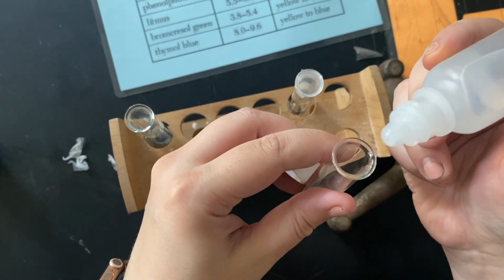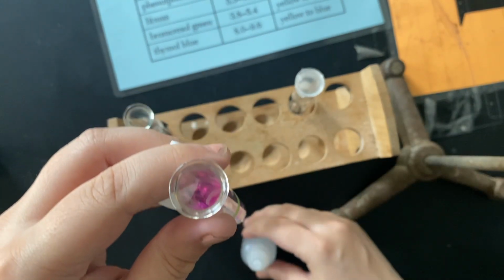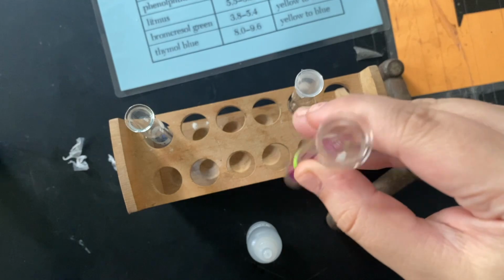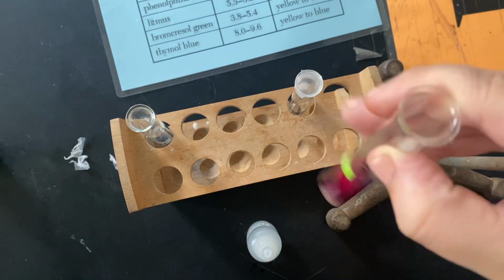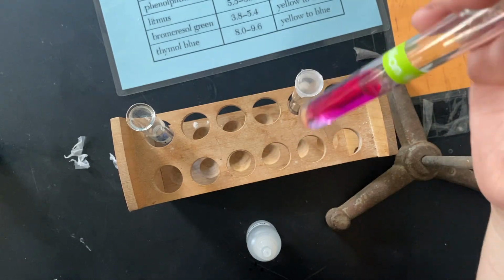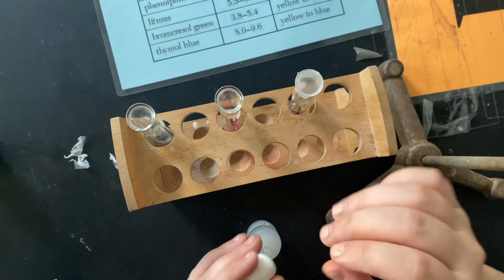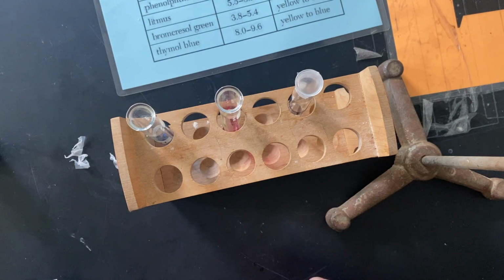We just need 2-3 drops of our indicator. So give it a nice little swirl. Potion number 2 turns this hot pink color. Then use that information to determine if it was brewed correctly, what it should have been, and then compare it to what it is.